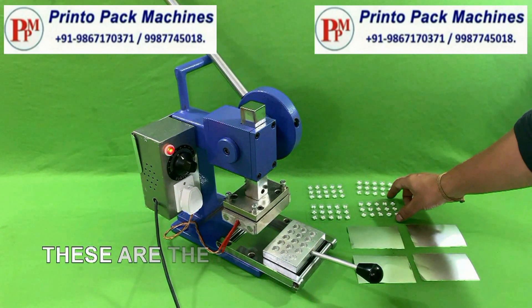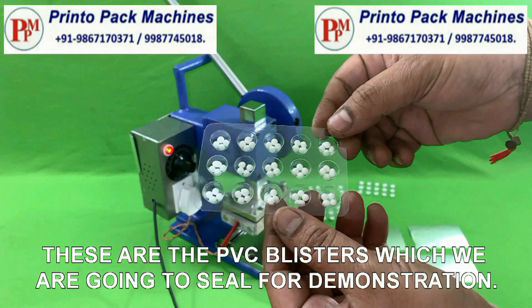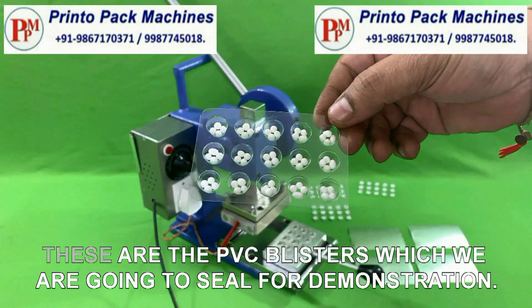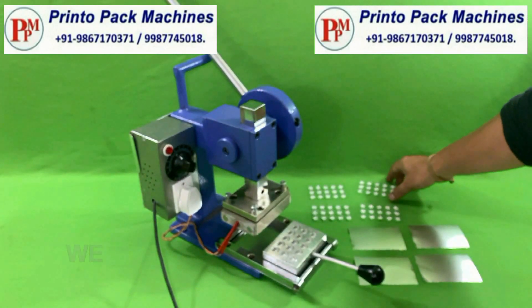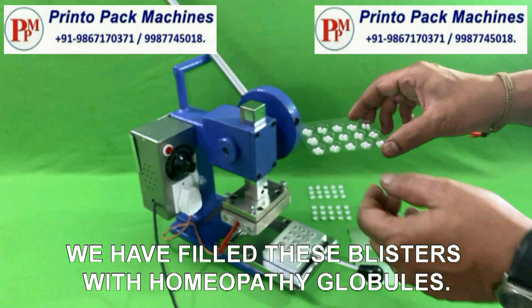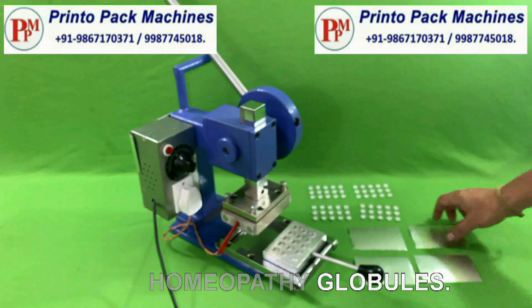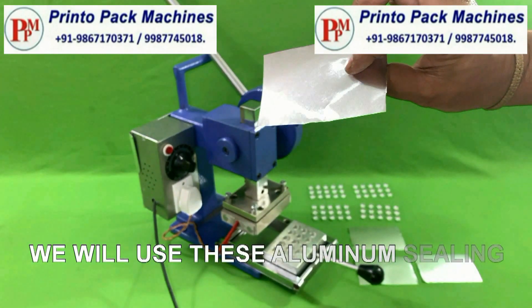These are the PVC blisters which we are going to seal for demonstration. We have filled these blisters with homeopathy globules. We will use this aluminium sealing foil for blister sealing.